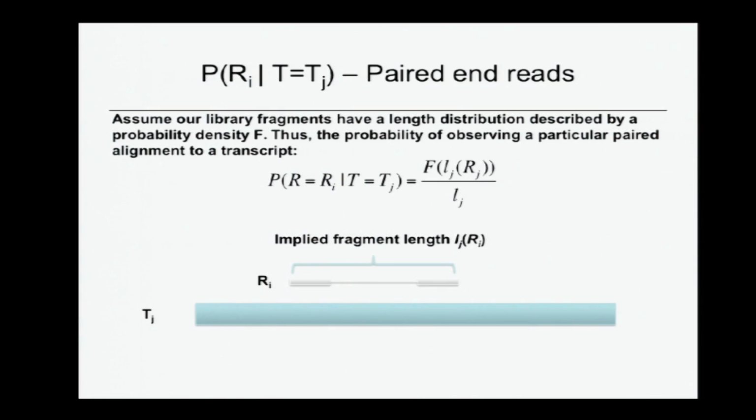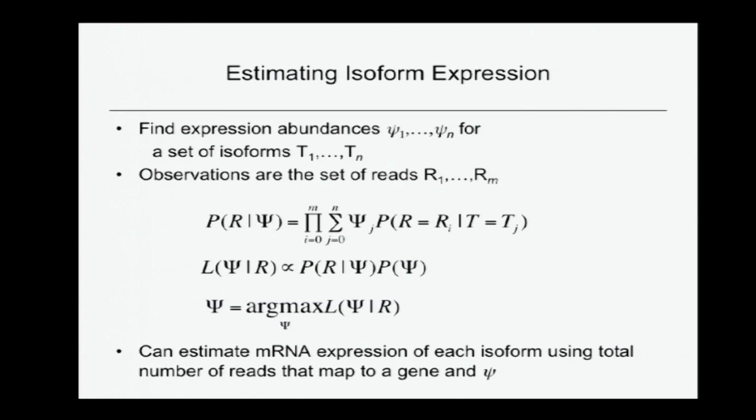Okay, so once we have this structure, we can then estimate isoform expression. Now, we talked before, when we talked about DESeq last time, the idea of estimating proportions.